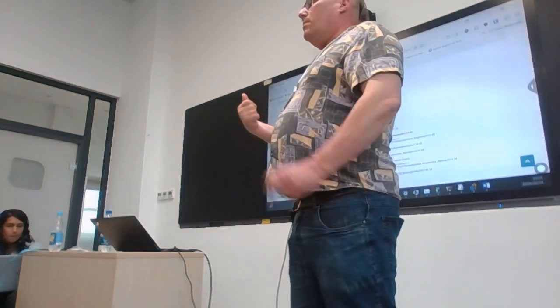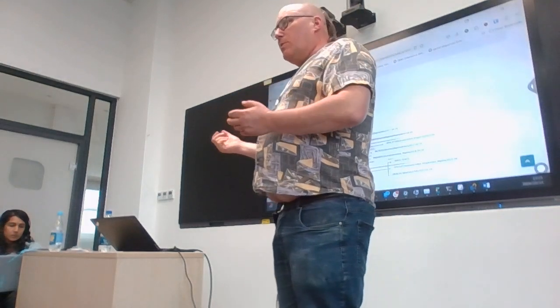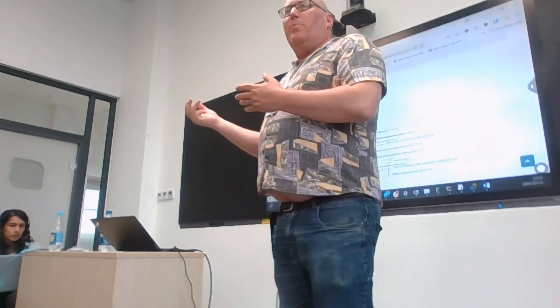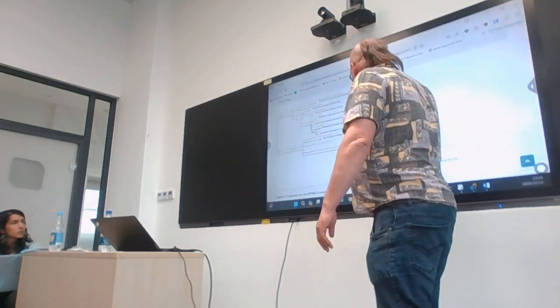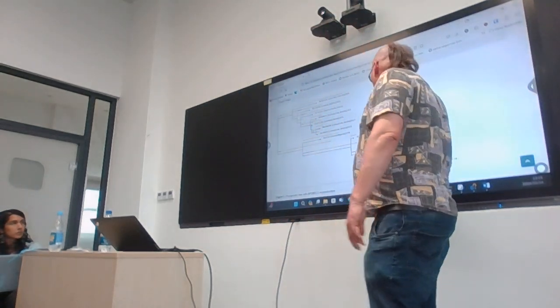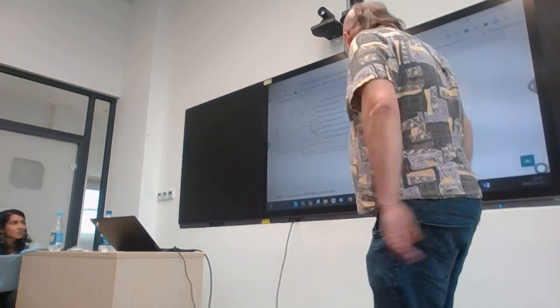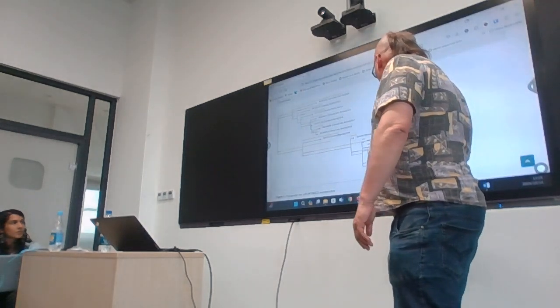And this is how you can see, if you've got a sample and you want to know whether what you're looking at is probably part of a human transmission chain, then the new mutations, are they APOBEC or not APOBEC? It's not guaranteed. You can get the APOBEC mutations just by chance, but if they are all showing up like here as APOBEC mutations, then we can see here, and here's our sample over there, that it is part of this human-to-human transmission chain.